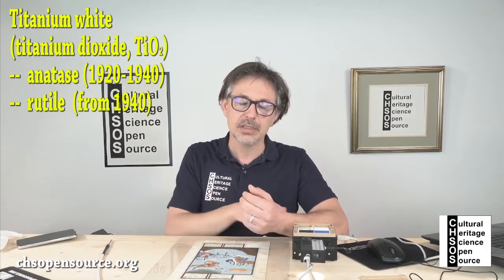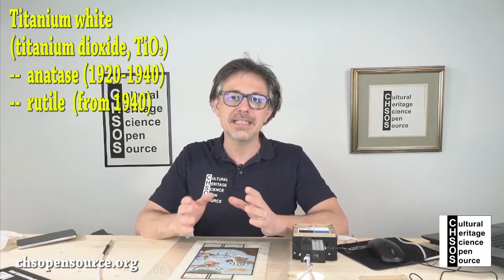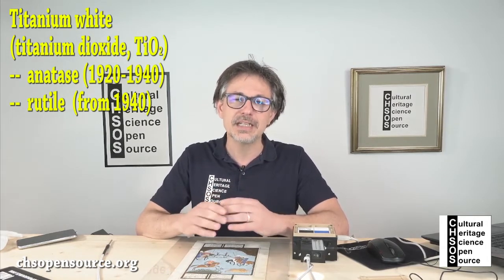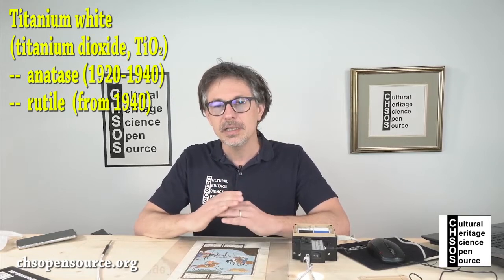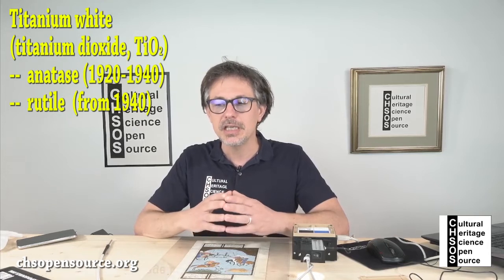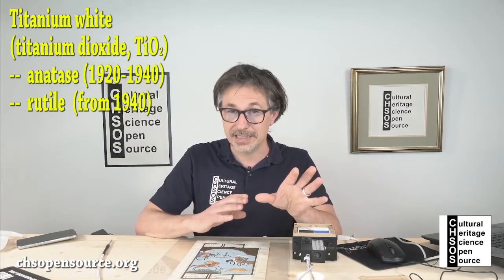Why is it important to be able to distinguish between these two kinds of titanium white? Because titanium white at the beginning was made using anatase. So from the 1920s until the 1940s roughly, titanium white was made of anatase.